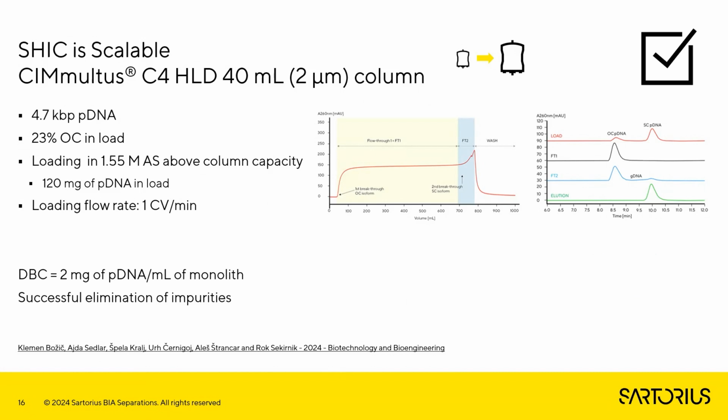We need to highlight that in this approach, in this mode, all the column capacity is practically used only for your target molecule. So let's say it's not misused with impurities which would bind to the support in case of higher salt, higher ammonium sulfate used. And this means that actually the benefit of this approach is even higher in case of more impurities, because you avoid binding them, so you can really use all the capacity only for your target molecule.